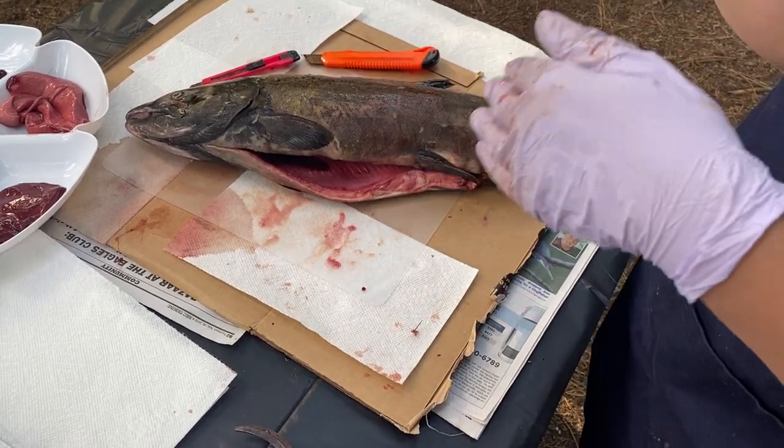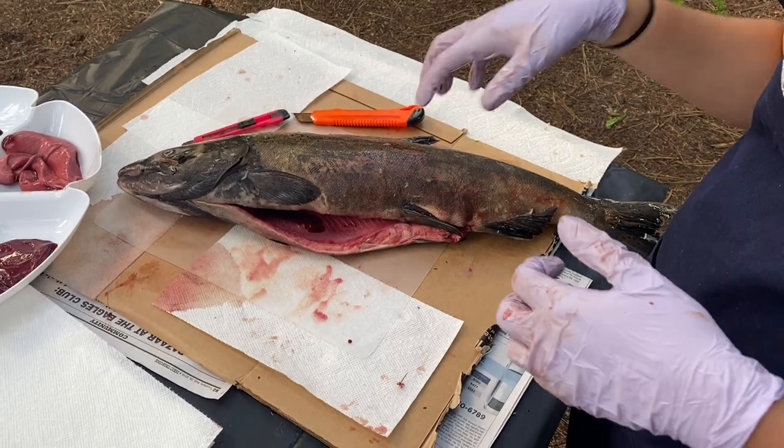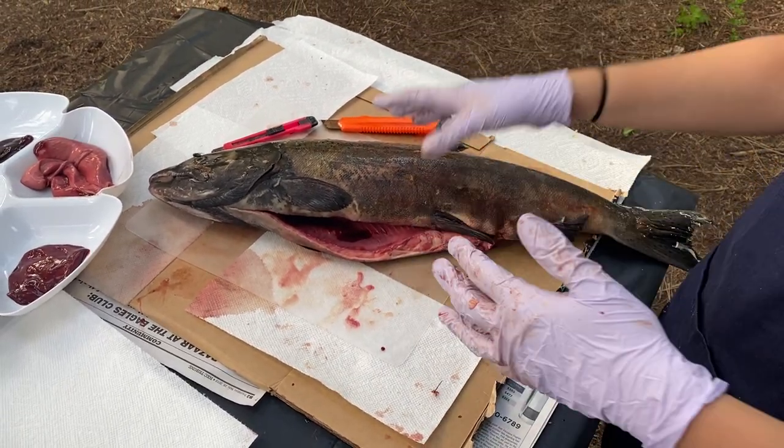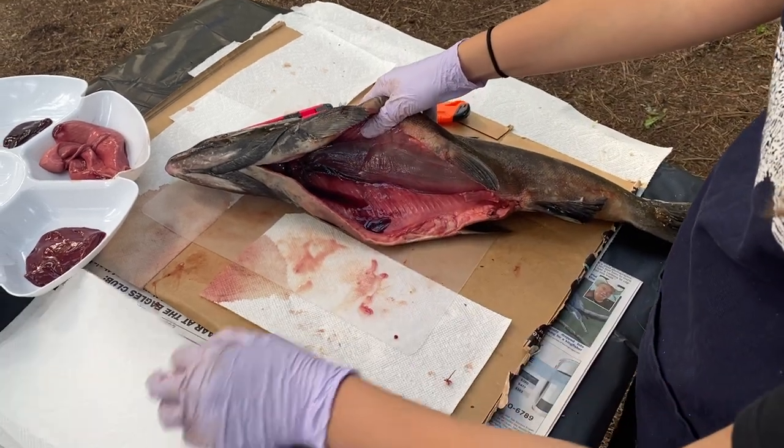And so if you guys have ever been swimming and you try to swim to the bottom of a pool and your ears feel like they have pressure behind it, that's because there's a different pressure on the outside. So this helps regulate for that pressure change.